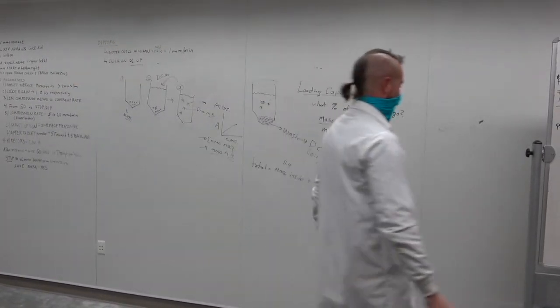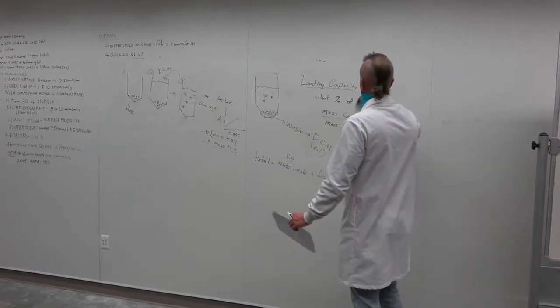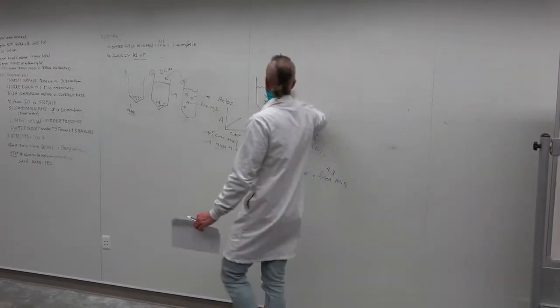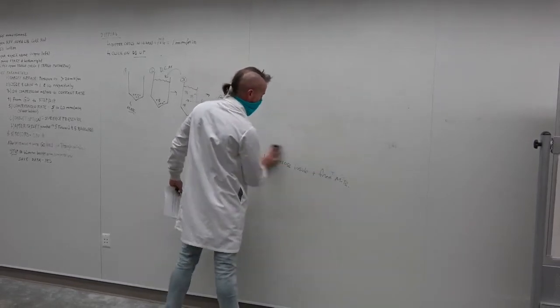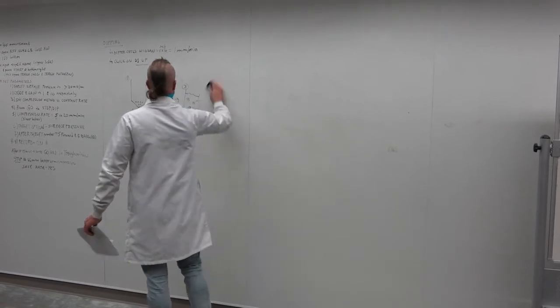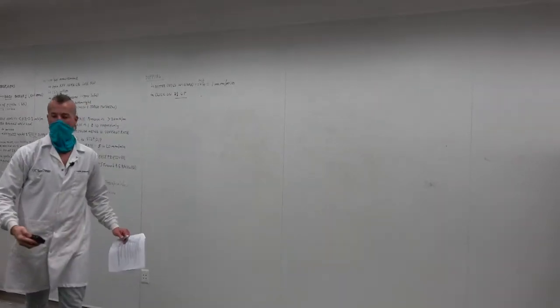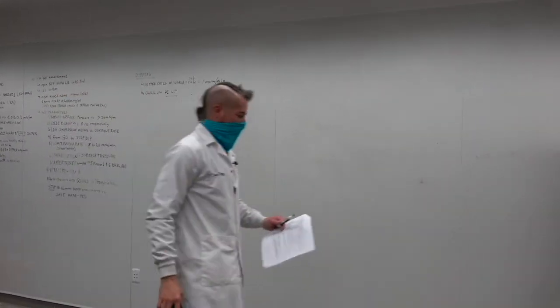Okay? And then the last thing you're going to do in this module is you're just going to kind of simulate a sustained release.